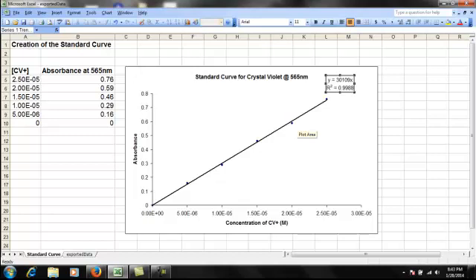As the reaction occurs, you are going to see a change, right? Because crystal violet, the species that absorbs light at 565 or 610 nanometers, is being used up in the reaction. Now, in order to determine the order of the reaction, you have to make graphs involving the concentration of this versus time in various forms, like either concentration, or 1 over the concentration of crystal violet, or the natural log of the concentration of crystal violet.